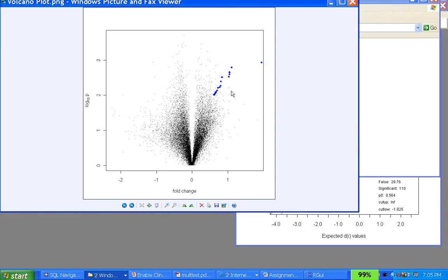So what this is showing you at the end of the day is that you have a high fold change and low p-value, and these are your overexpressed. The volcano plot is the p-value versus fold change. The ideal condition you want is a very high fold change and very low p-value. So that's a very good one. And then maybe there is a way for you on this plot, other than just plotting it, to also annotate the exact probe sets that you have.